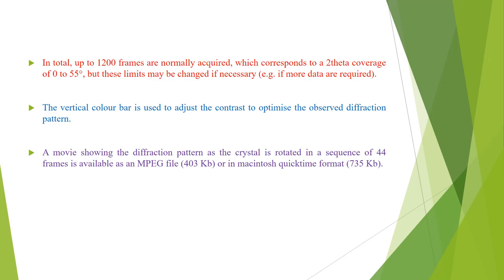And a movie showing the diffraction pattern as the crystal is rotated in a sequence of 44 frames is available as an MPEG file of 403 kilobytes, or in Macintosh QuickTime format, which is 735 kilobytes.